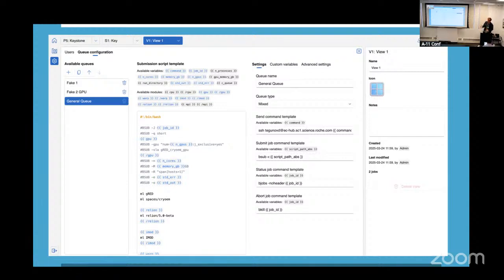In this case, we are submitting jobs to a high-performance computing cluster. These could also just be run locally on one machine if you have workstations, or if your company is a cloud company, you could go to the effort to get it set up there. There's no fundamental reason any of these things don't work, but this is the interface we provide. For most people that is flexible enough and will get them going, but it might take a bit of setting up in the first instance.